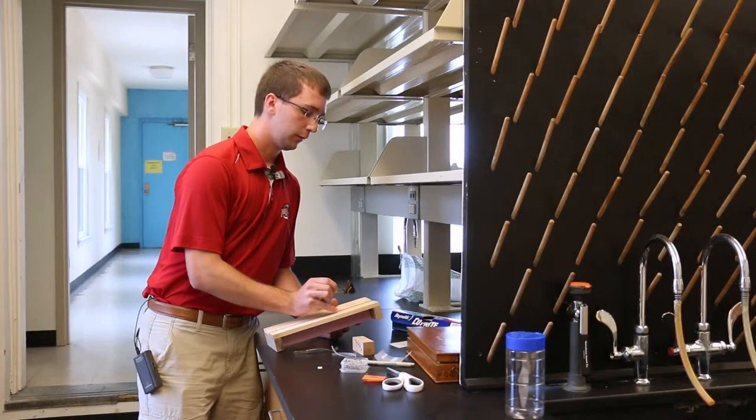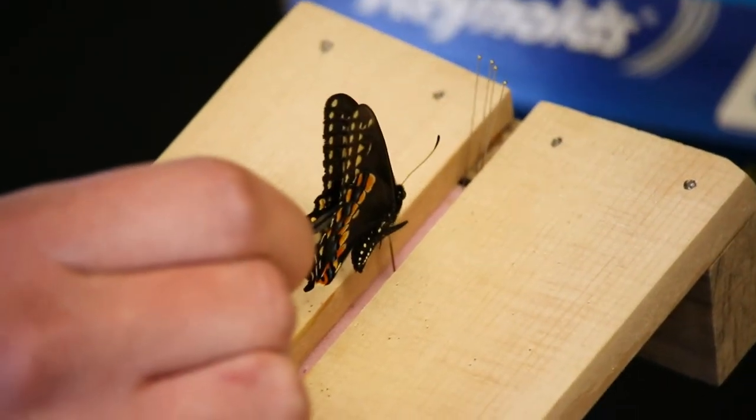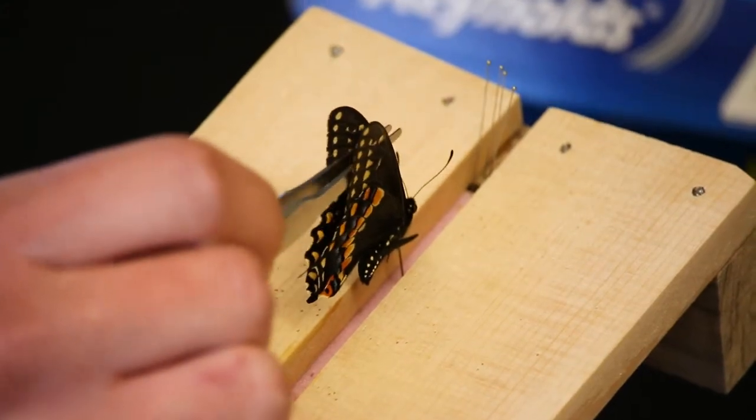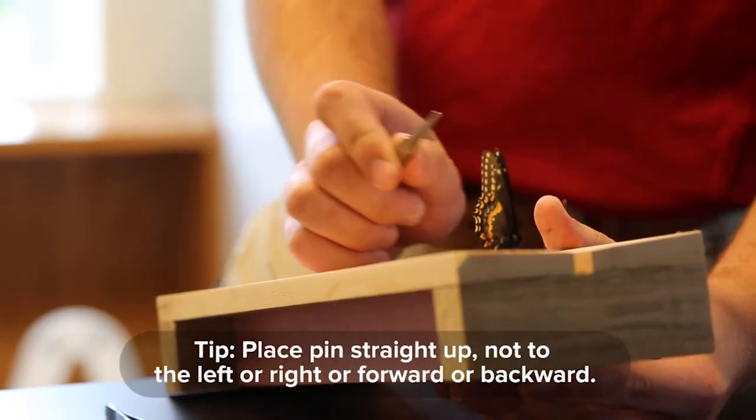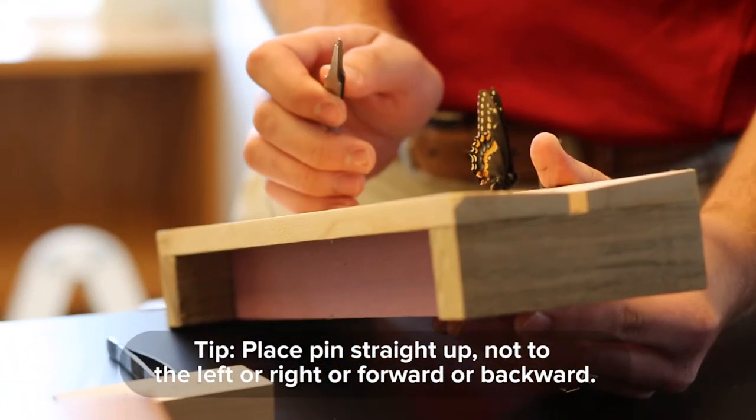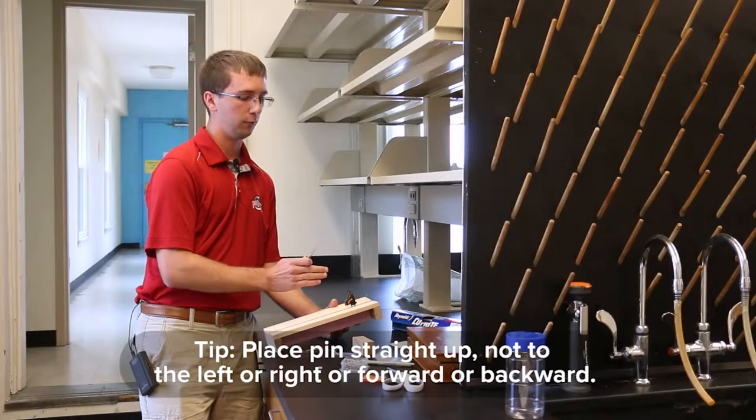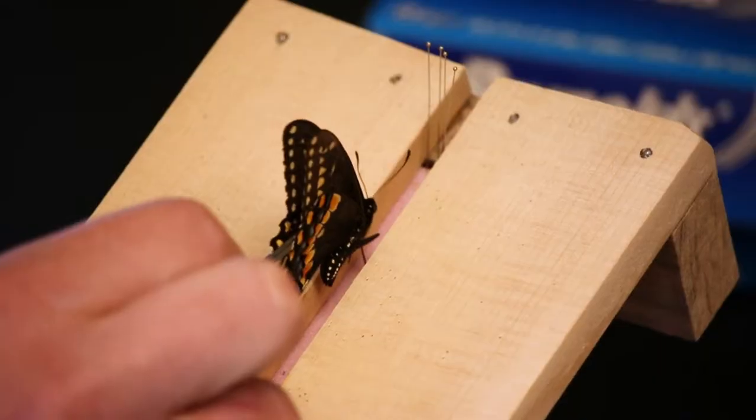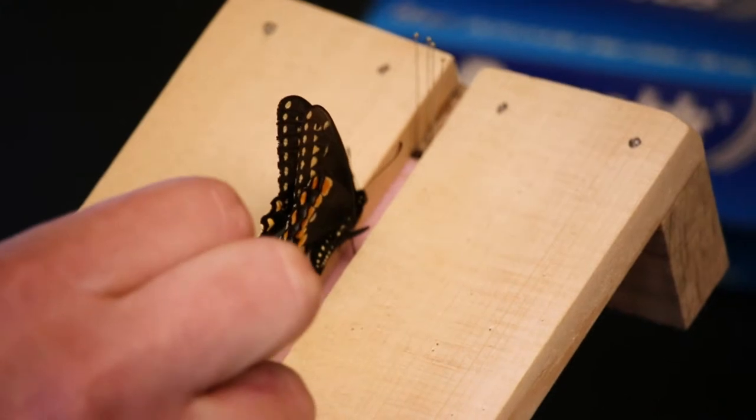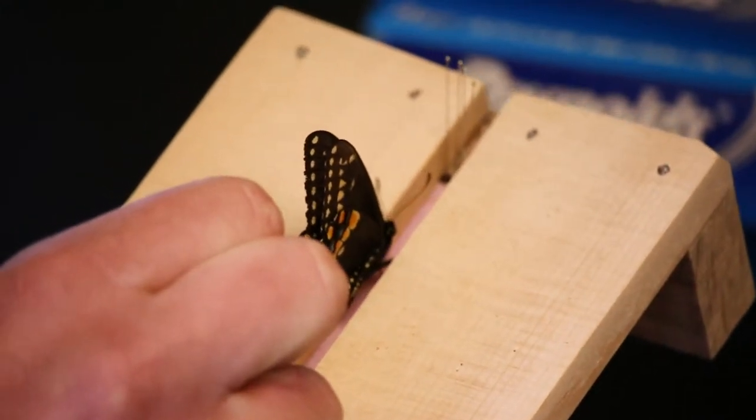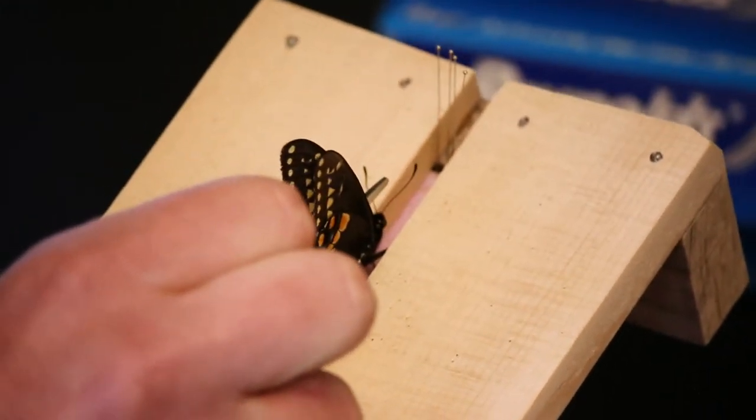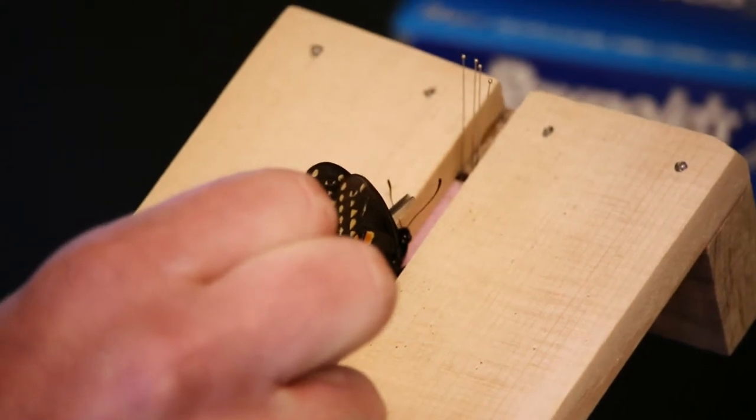You need to put the insect in the center of the groove and make sure that the pin is not going into the styrofoam at any angle to the left or the right or forwards or backwards. I take the pin with my forceps again and push the insect down so that the wings are level with the spreading board surface.